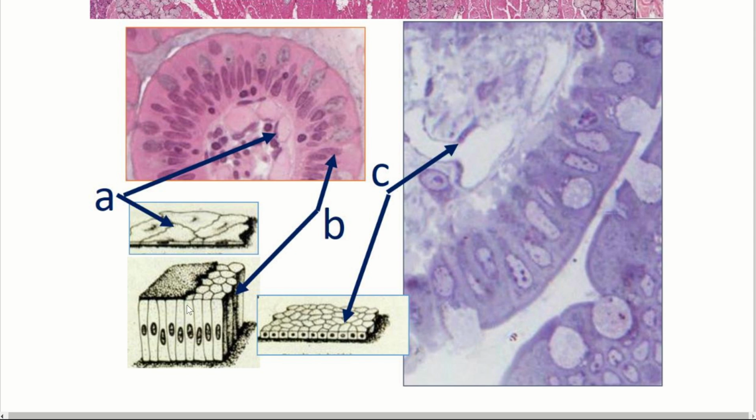Whereas B is depicting simple columnar epithelium, and this is also simple columnar epithelium, because it is one layer of column-like cells. This is in your small intestines. This is one of those villi that we have, we've just done it in cross-section. So instead of cutting your finger lengthwise in half, I know this sounds weird, we're cutting a chunk off, like a carrot. That's how we're looking at it, kind of end on. And you can see those simple columnar epithelial cells there.